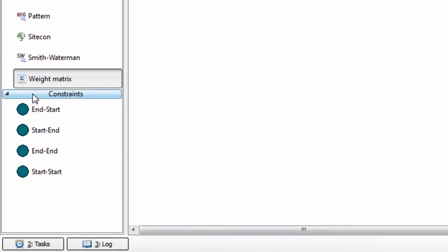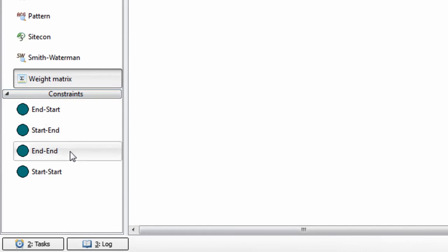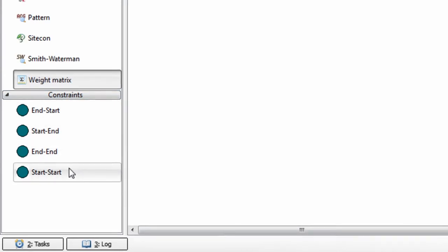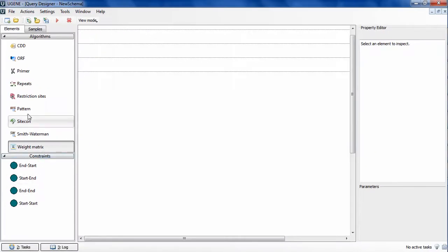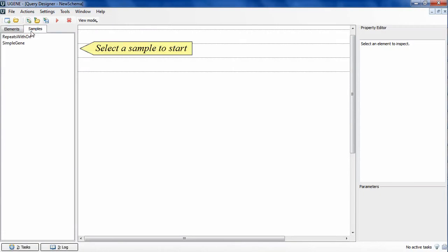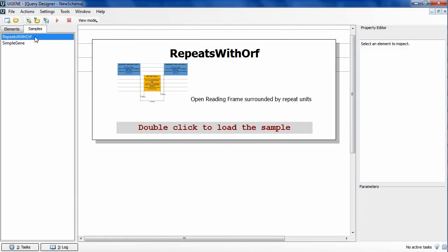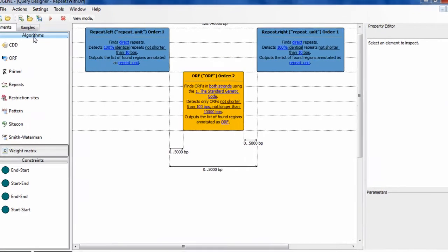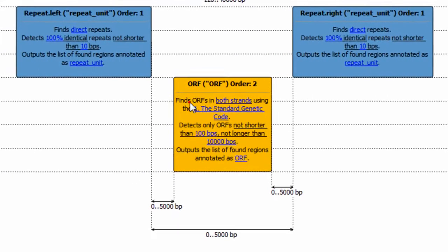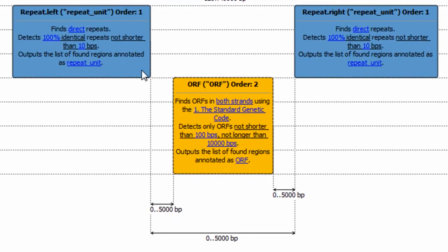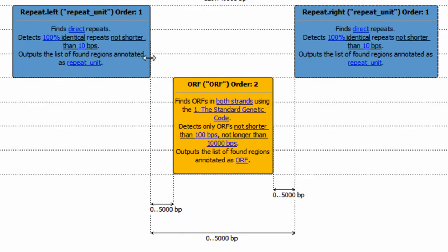And at the same time imposing constraints on the positional relationship of the results obtained from these algorithms. The constraints are specified by Query Schema that can be designed in Query Designer window that is similar to UGENE Workflow Designer window. Let's consider this schema that contains an ORF region surrounded by two repeat units, so that distances between the ORF region boundaries and the repeat region's boundaries will not exceed 5000 symbols.